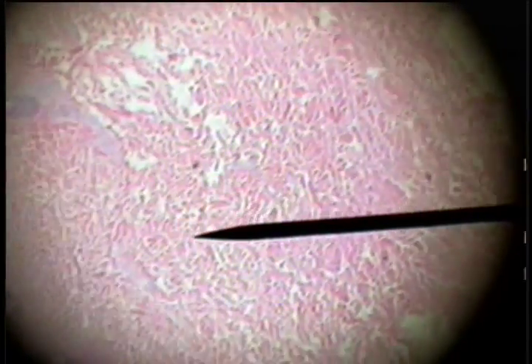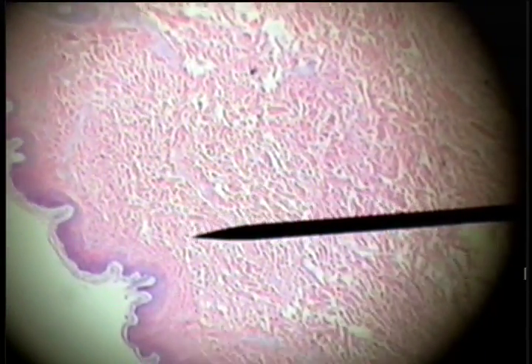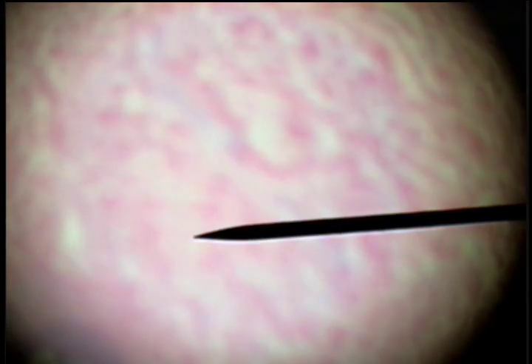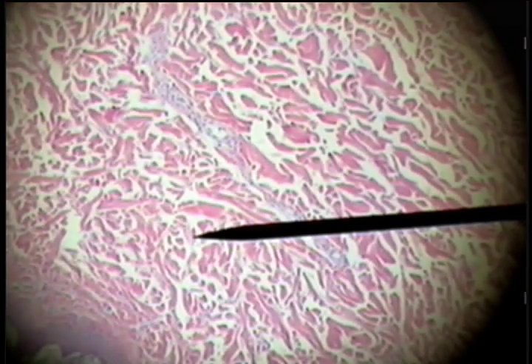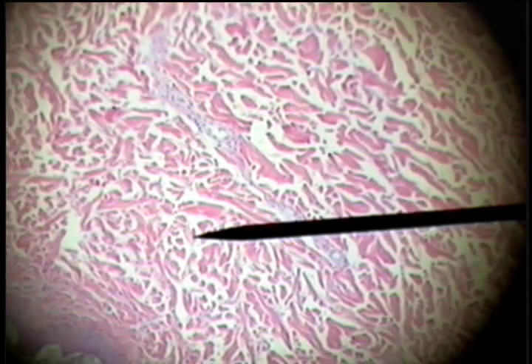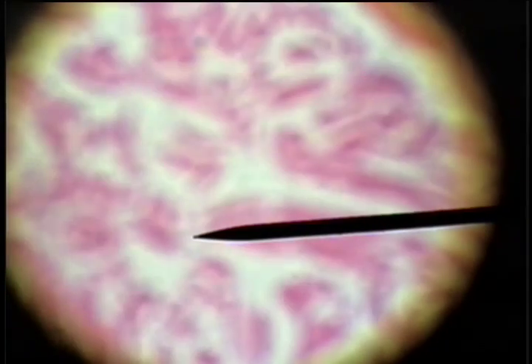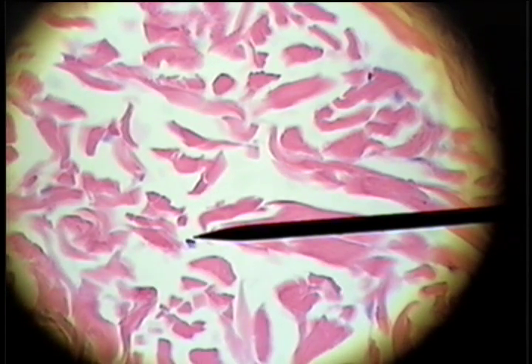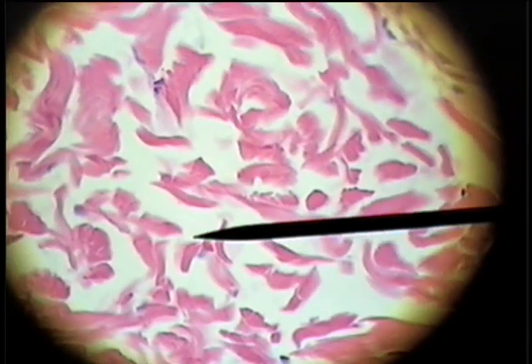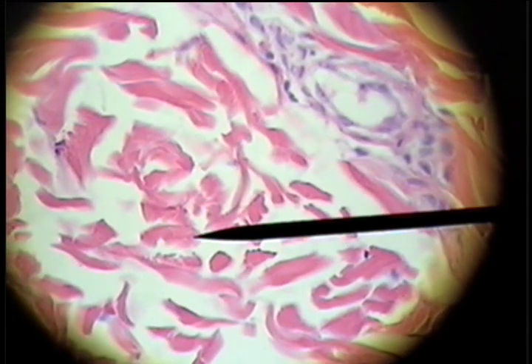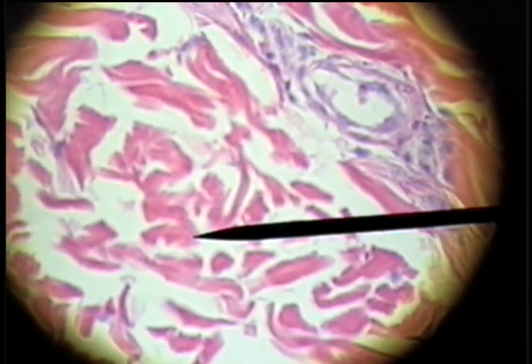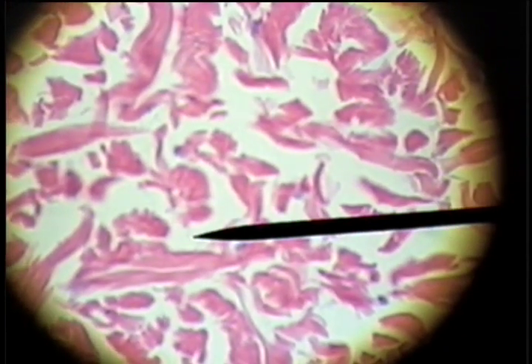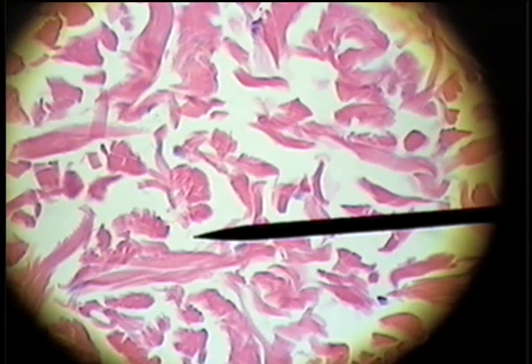So if we go back to this layer, this is made of dense, irregular, collagenous connective tissue. We can see that the collagen fibers are arranged in a random or swirled pattern, so that there is an irregular shape. These fibers interdigitate or interweave with each other to give great strength to the dermis of the skin.